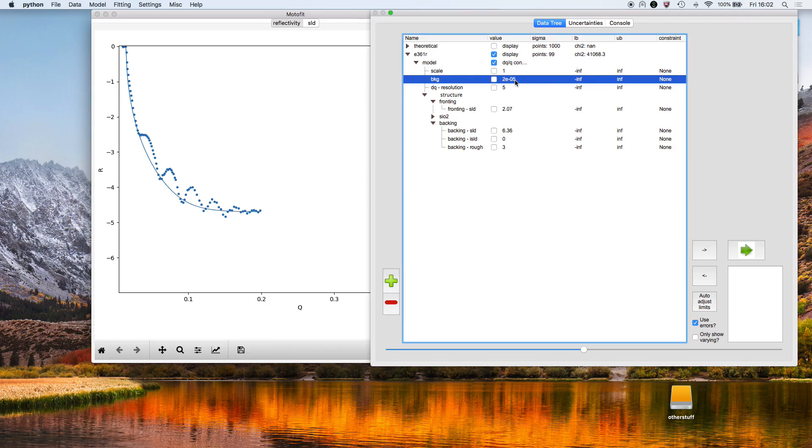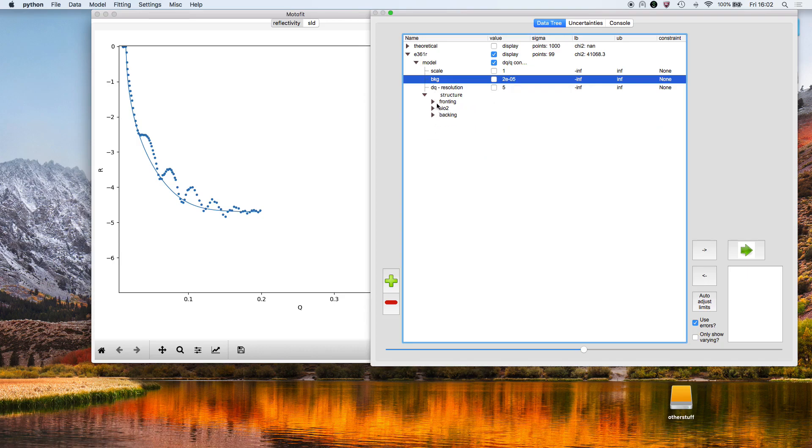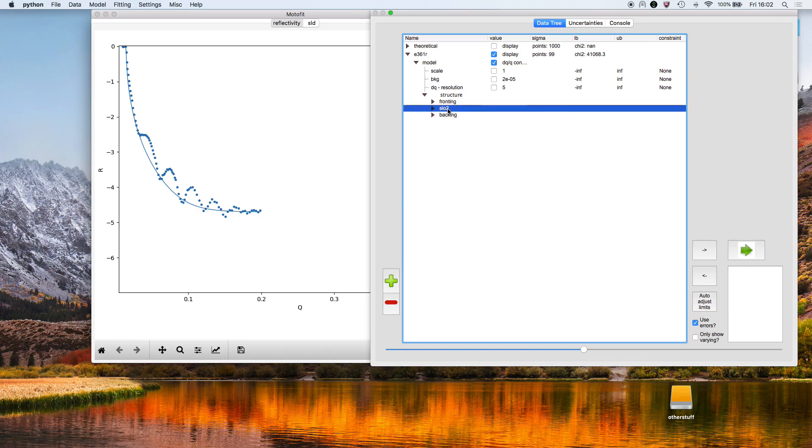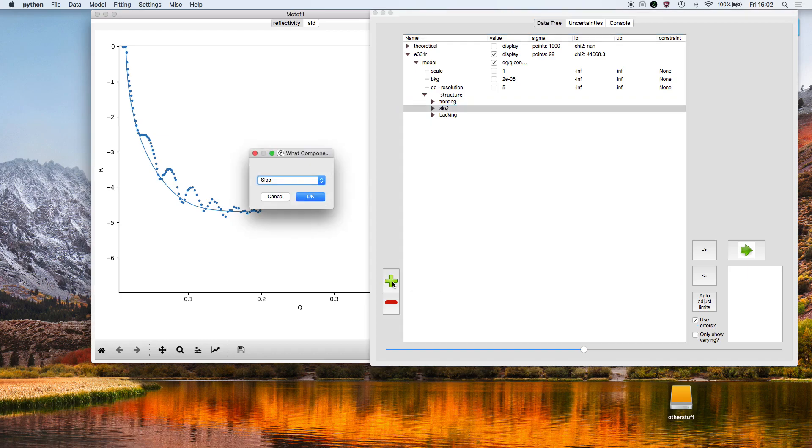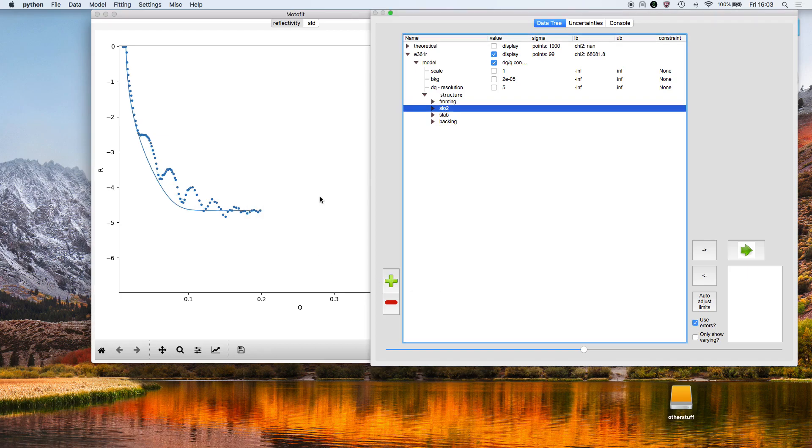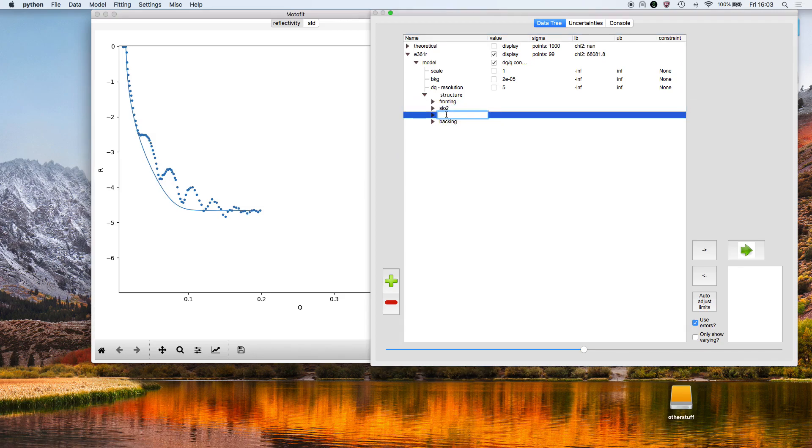So I select the silicon dioxide layer, click on plus, and I'm going to add a slab. The slab now appears after the silicon dioxide. I'm going to rename it polymer.